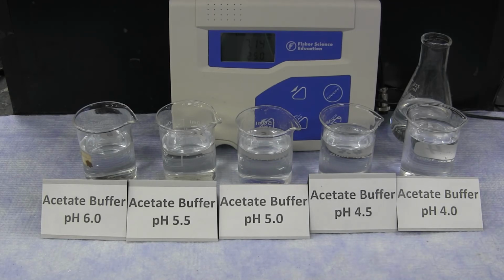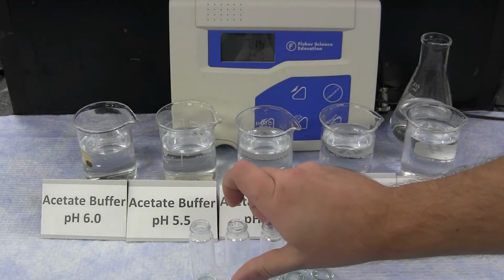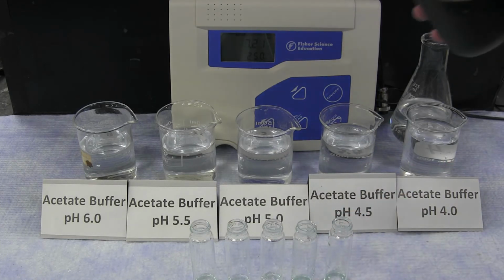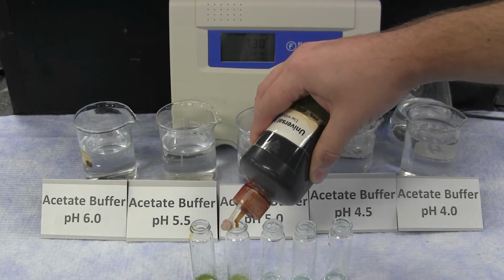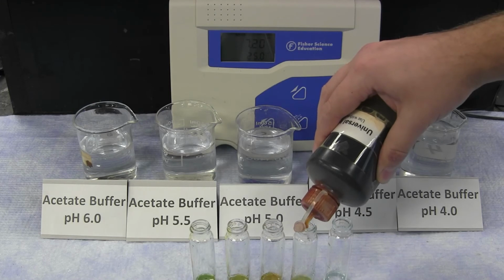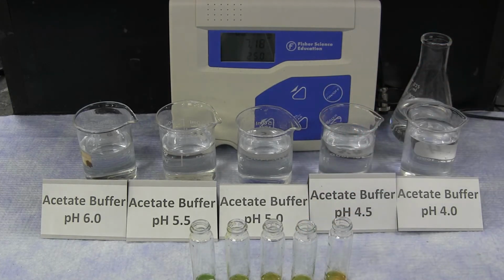All 5 of these solutions are solutions of acetate buffer, ranging from pH 6 to a pH of 4. If we look at these buffers using universal indicator, we can see the gradual pH range and how it changes as a function of the concentration between the conjugate acid and base pairing.